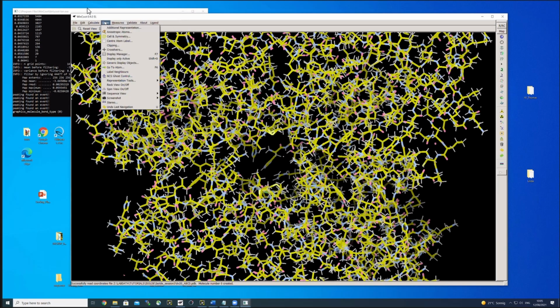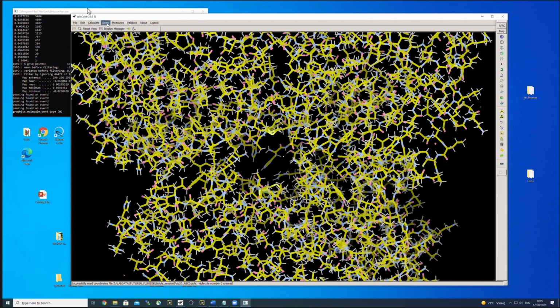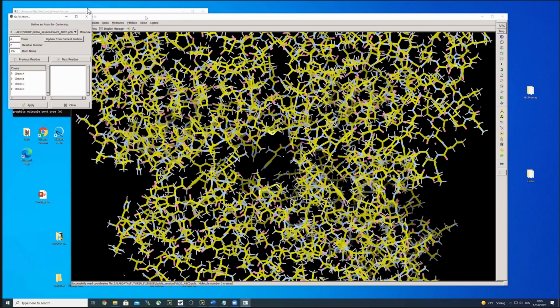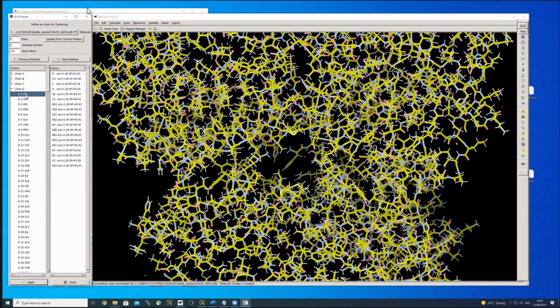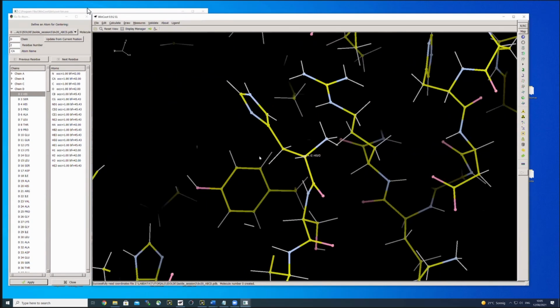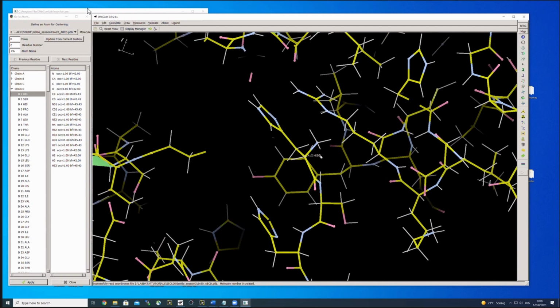Under Draw, Calculate and Edit are the most important features that we're going to need. For example, we can go to Draw and then go to Atom. That gives you an Atom viewer window. First of all, you get the 4 chain IDs displayed, and I would like to go to chain, let's say, D, and you can select the residue, and by double clicking you will be sent to this residue in the structure. Here it is, it's a histidine residue, position number 2, histidine in chain D.